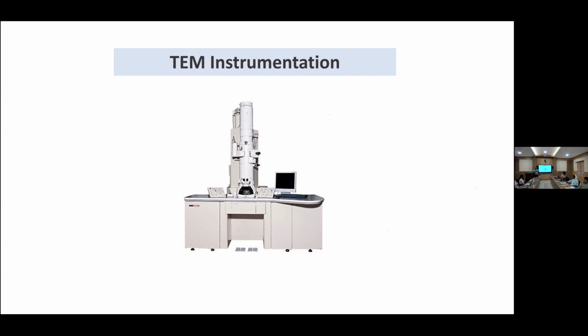Yes. Line defects we can identify from our normal TEM higher resolution images. Yeah, it's possible. But for these vacancies, it's difficult.